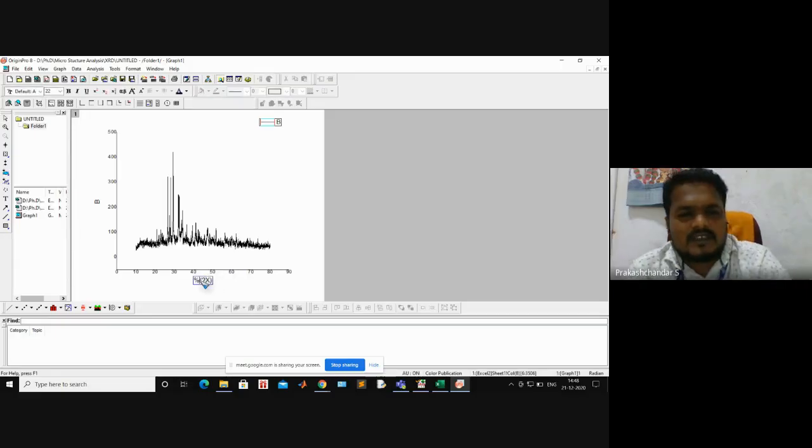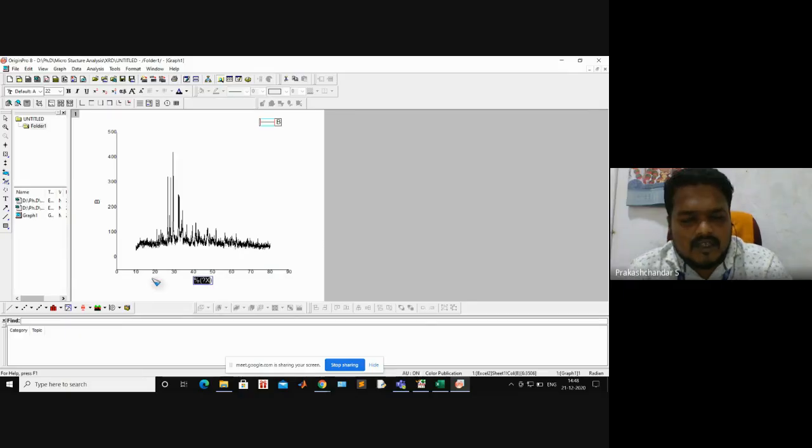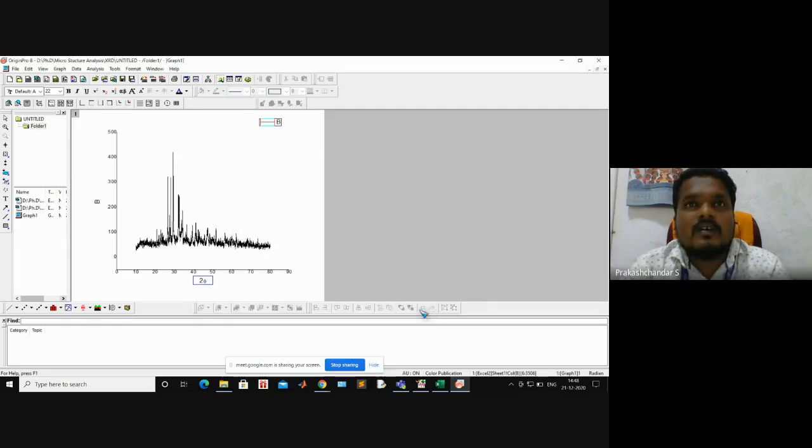You can make it here, right click and make it 2 theta. 2 theta is there. Okay, 2 theta. And here you can make it intensity. Okay, right click this one.